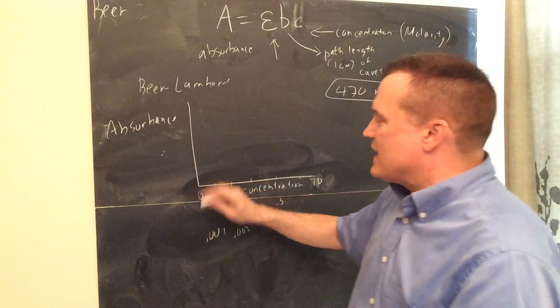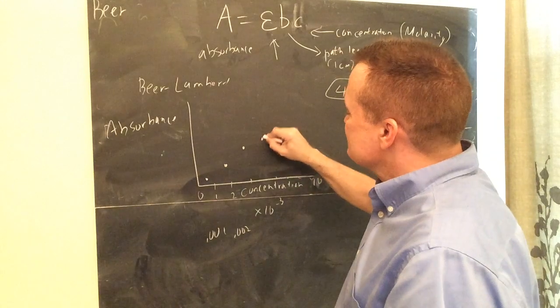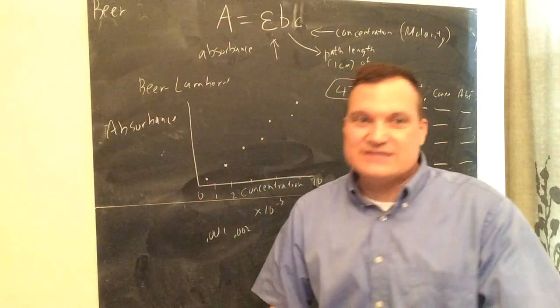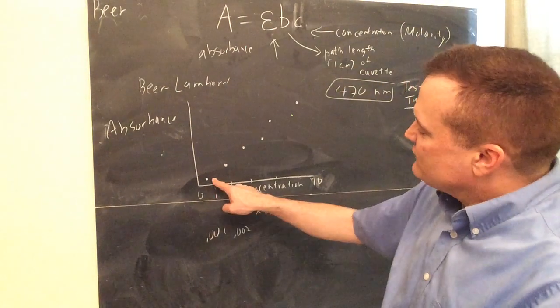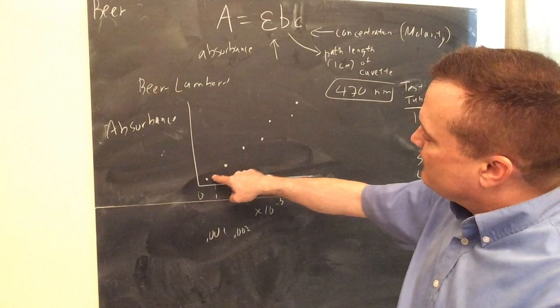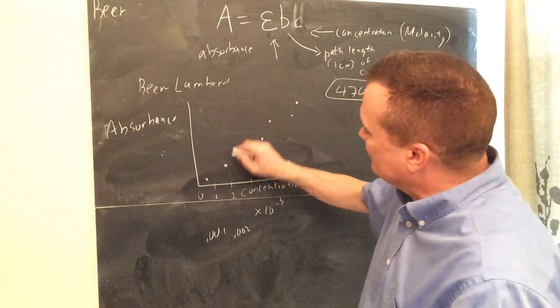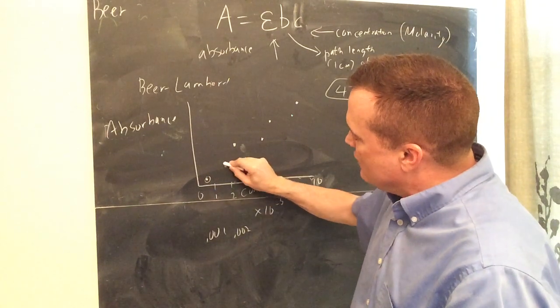Okay. Anyway, when you graph these two, you're going to get some dots. Now, this is something I want you to be aware of, a science skill in physics, chemistry, everything. When you graph your points, they might not be perfectly lined up. They might look like that, a little bit off. One could be really far off. I'll just put it there. So what you should do is always circle all the dots.